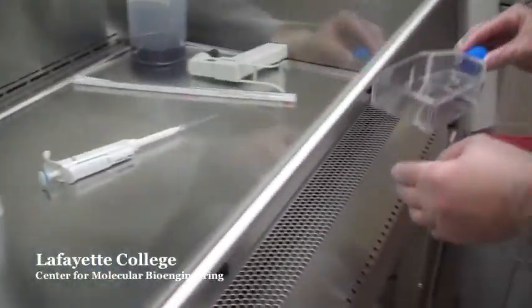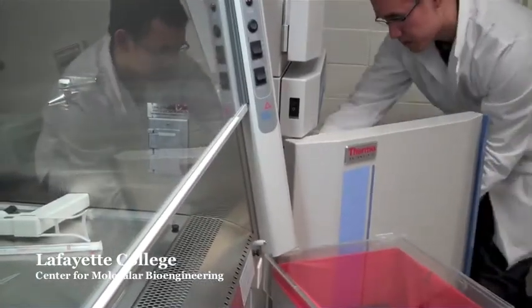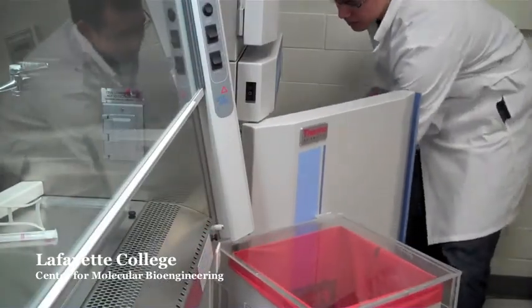Now place the flask inside the incubator for 5 minutes. After 5 minutes, take out the flask.